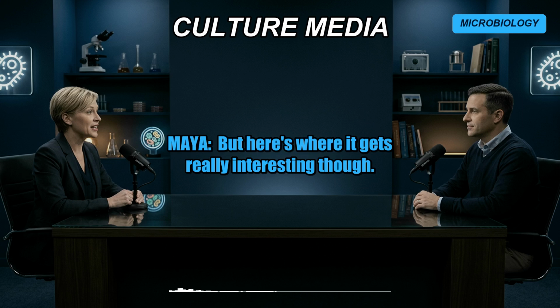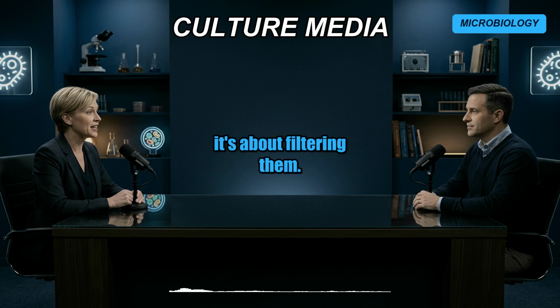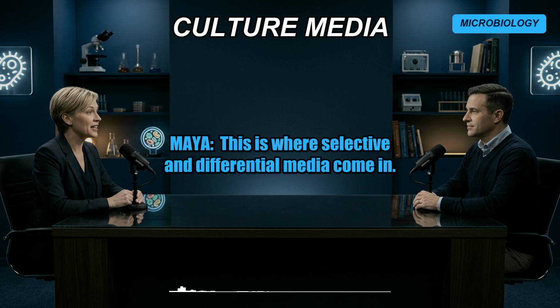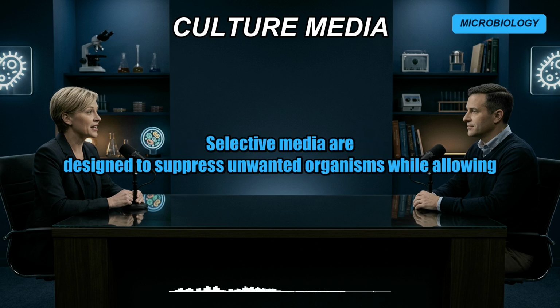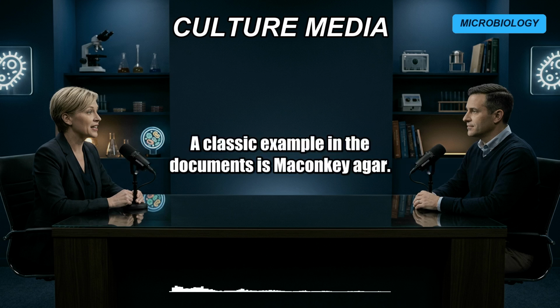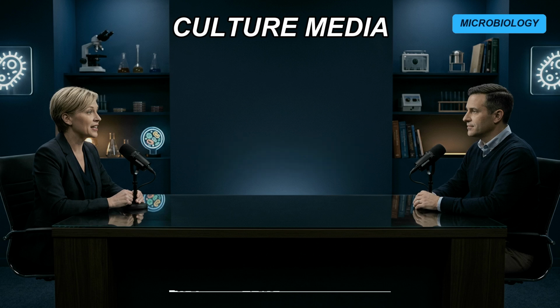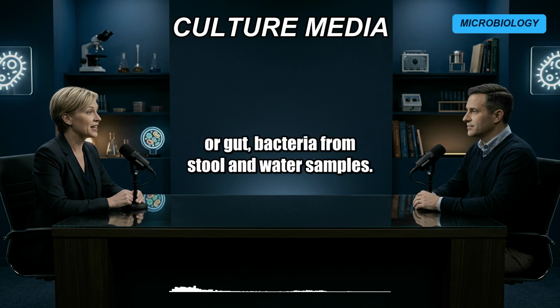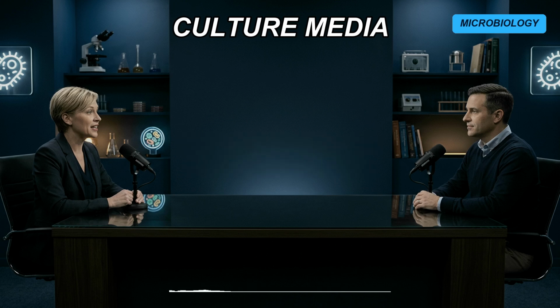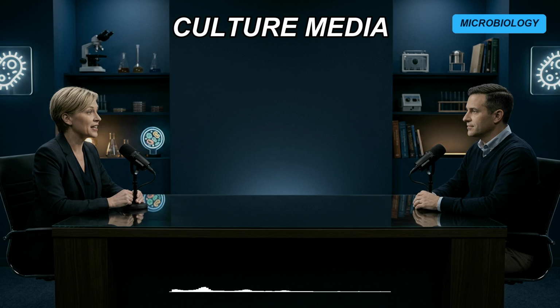But here's where it gets really interesting, though. Media design isn't just about feeding things, it's about filtering them. Filtering, right. This is where selective and differential media come in. Selective media are designed to suppress unwanted organisms while allowing your target organism to grow. Right. A classic example in the documents is MacConkey agar. It was developed around 1900 to isolate enteric, or gut, bacteria from stool and water samples. Yeah, MacConkey is a staple. And it contains bile salts and a dye called crystal violet.